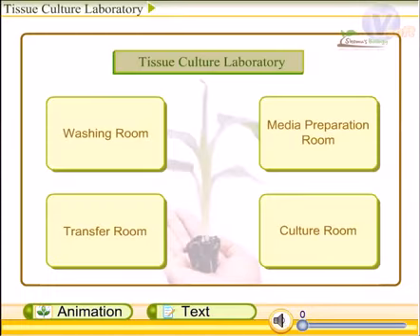Welcome friends. In this video we will be talking about the tissue culture laboratory and the important measurements in the tissue culture laboratory, which are important to go into the detail about tissue culture. The laboratory of tissue culture consists of four main sections. They are washing rooms, media preparation rooms, culture room and the transfer room.